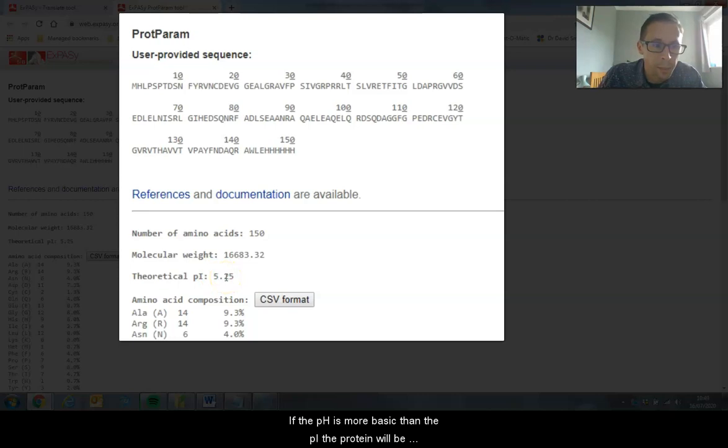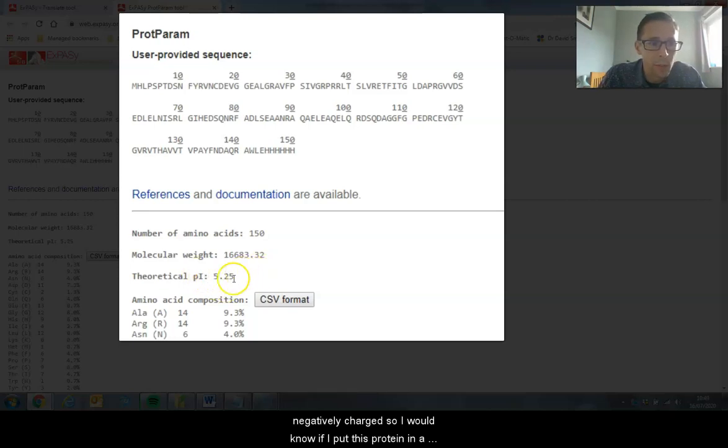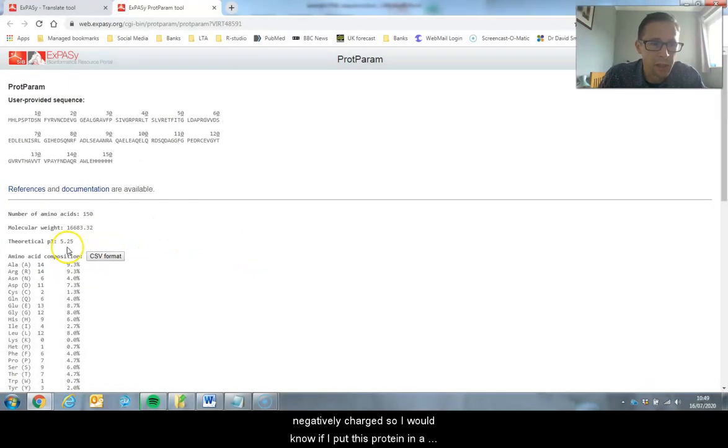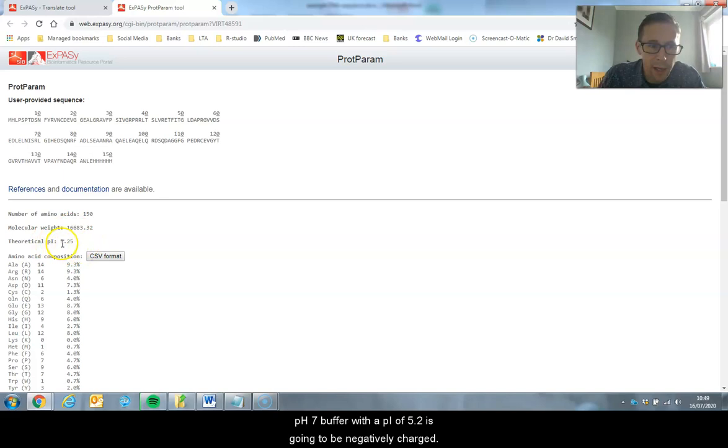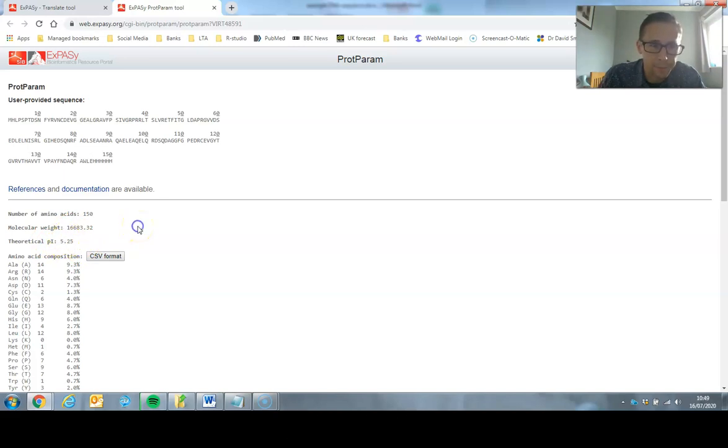If the pH was more basic than the PI, the protein would be negatively charged. So I would know that if I put this protein in a pH 7 buffer with a PI of 5.5, it's going to be negatively charged.